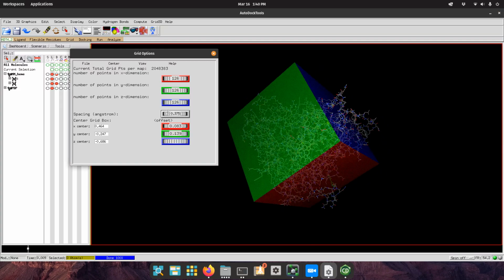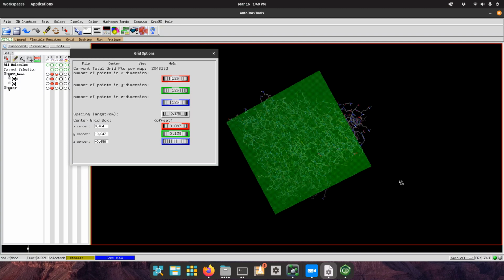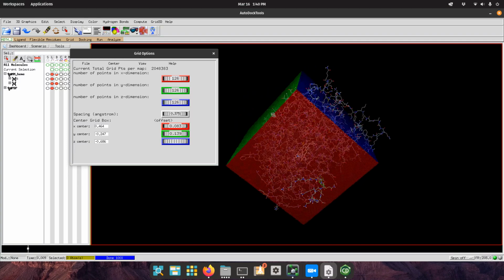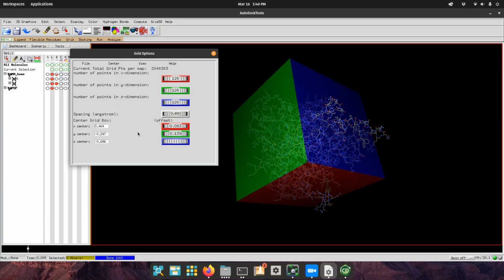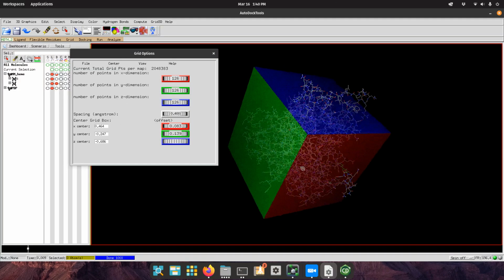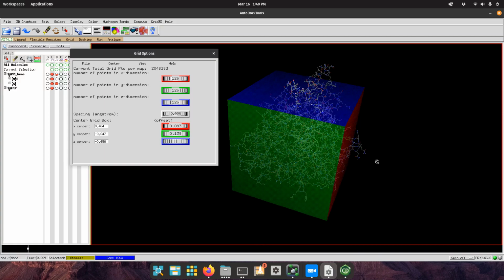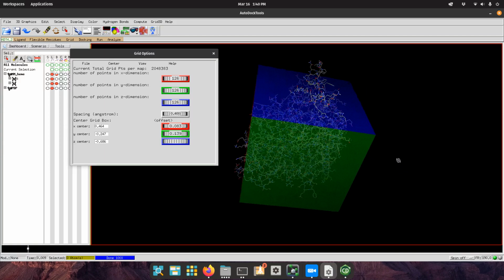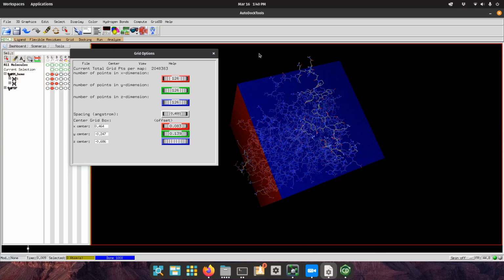If it doesn't cover, you can right click here and make the value of the spacing to be a little bigger, like 0.5 or something like that, and then you can cover more territory. But I'm thinking that's probably gonna be enough. I'm just gonna maybe make this 0.4. Okay, that's probably big enough to cover almost the entirety of the protein. This would be called a blind docking experiment, because I'm just gonna pretend like I have no idea where this should bond or dock, I should say.